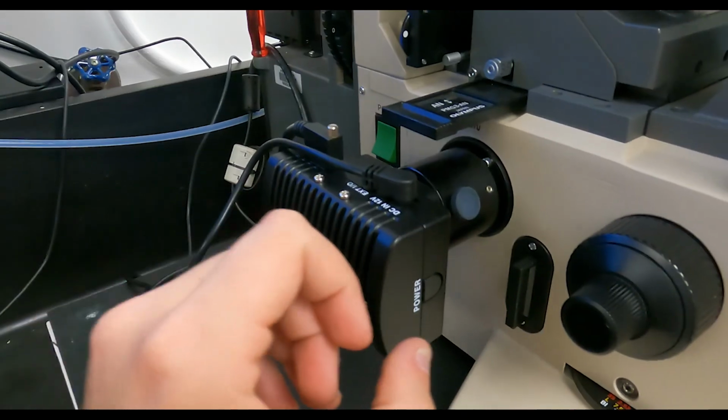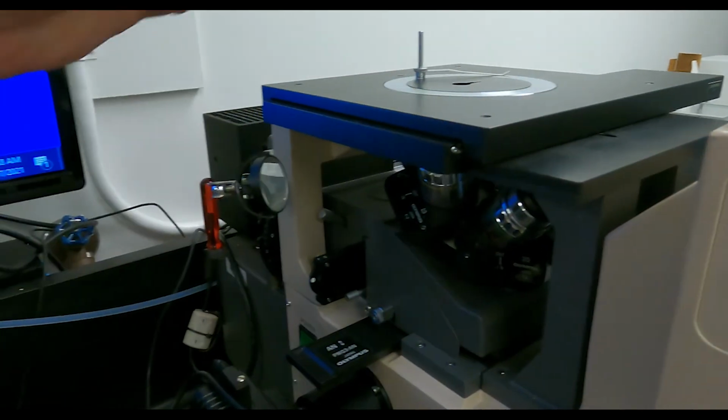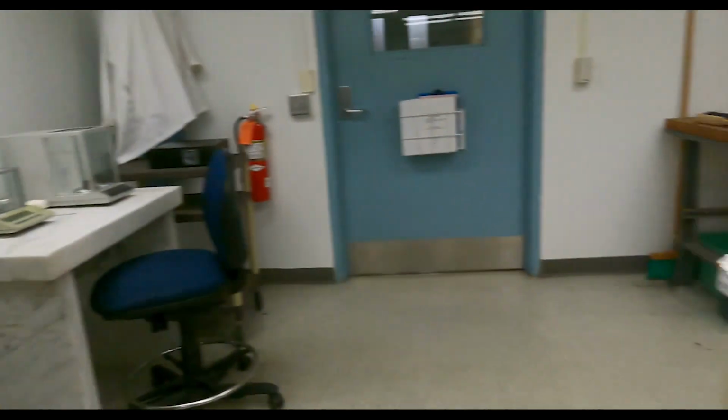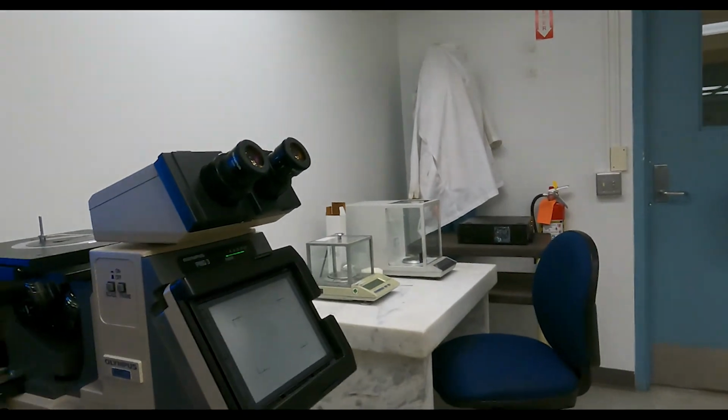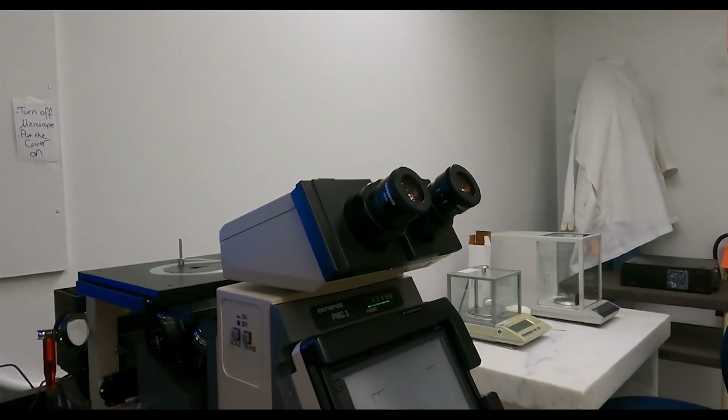Now that that is shut down, we can turn the camera off, and we can turn the power to the microscope off, and we can take our sample away. And then the last thing you're going to do is put the cover on the microscope, so that way no dust gets on your lenses, no dust gets in the camera.